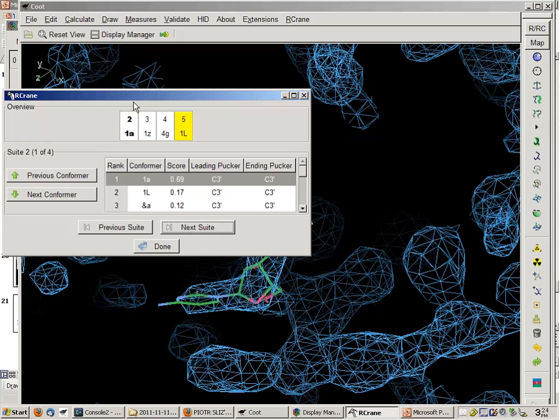Great. There's also actually questions from the audience. There was another question, if you could at some point go back and repeat to show people how to place this first phosphate. Sure, I can do that. Yeah, actually I was planning on doing that in a minute anyway for something else.